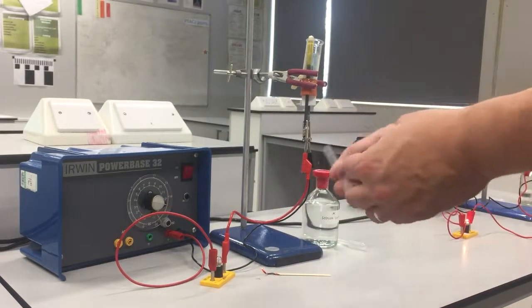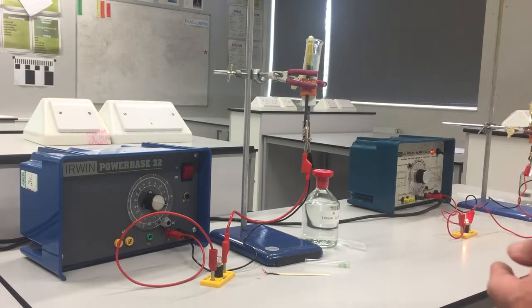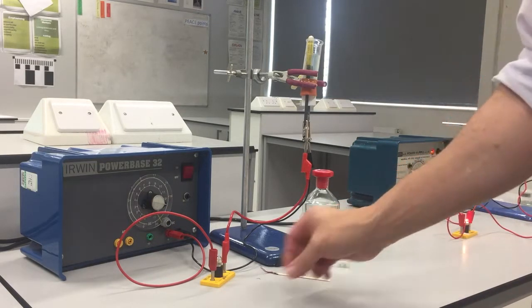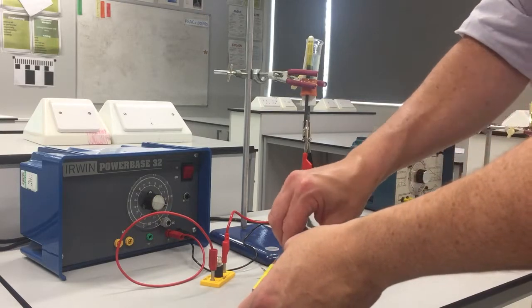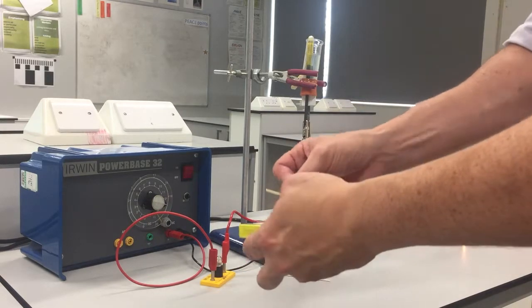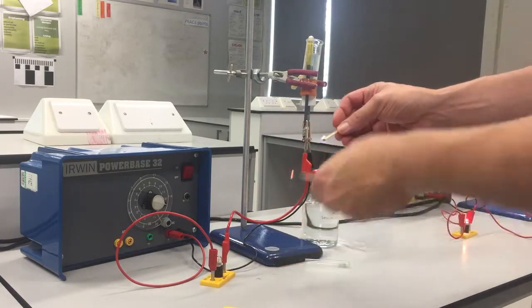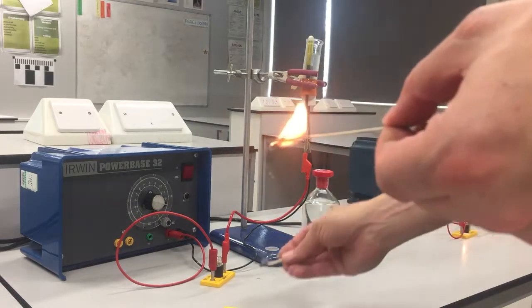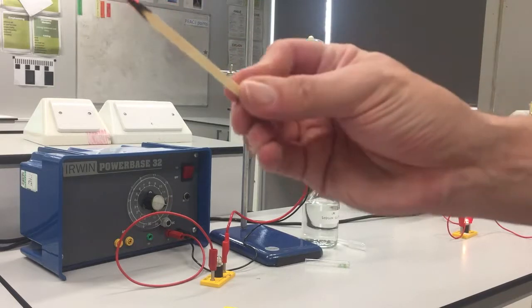Our last test is for the oxygen, and I don't think I've collected enough oxygen gas to do the test, but the oxygen test would be to take a splint that's glowing. Again, just lighting a splint here. And then you blow it out, but have it glowing like this.